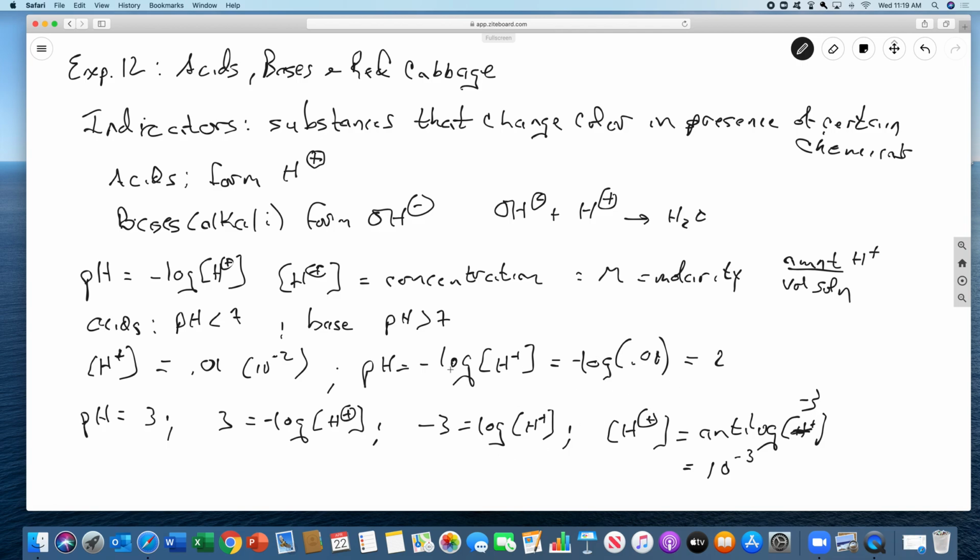And so really all you're going to do in this lab is play with this a little bit. You can do a little bit of the math, not much. And you're going to look at pH of various things. I pulled up for you the colors that the cabbage indicator gives you at various pHs, and I pulled up some data from some household chemicals, and you can line those up and see what the pH is. There's a section in the data that says using pH paper. I didn't get any data for that, so you can just cross that out.